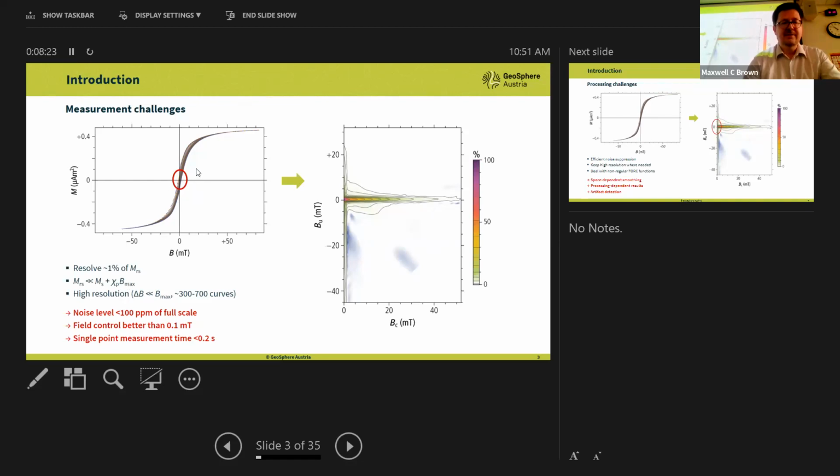On top of that, the remanence itself is small compared to the magnetization that you are measuring in the fields. And on top of that, many samples contain a lot of paramagnetic materials, which compress or squeeze the ferromagnetic contribution down farther. So this is the first challenge. The only way to solve it is to have machines that are more sensitive, and Lakeshore, for instance, is behind it.